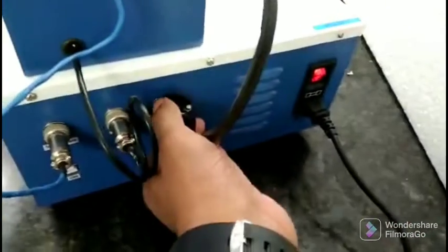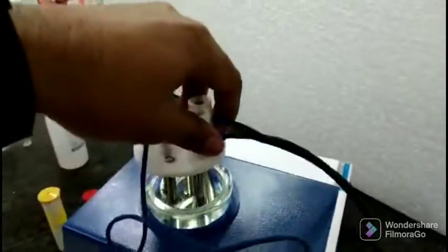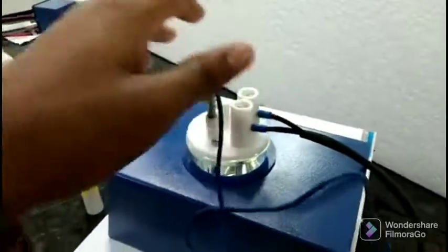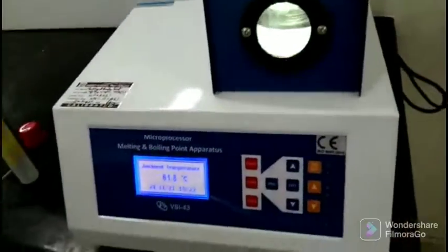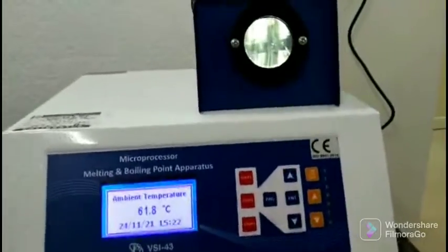And you connect your heater plug like that, and remove it like that and dip it inside your oil bath and connect it. In this video, we tell you how to operate this instrument in your laboratory and how the instrument is going to work.